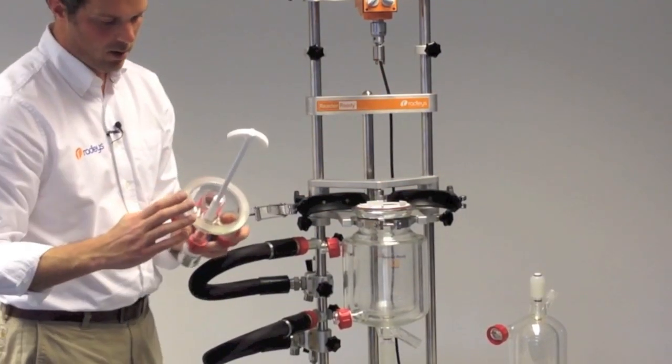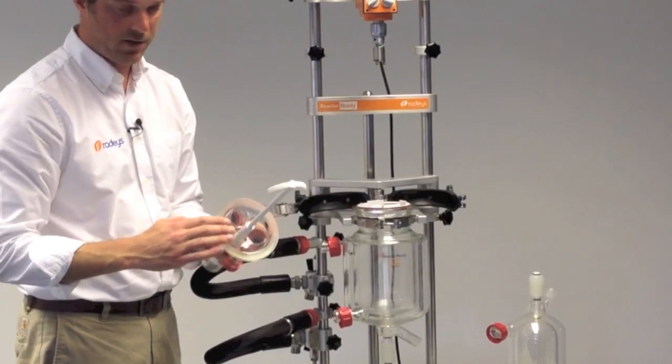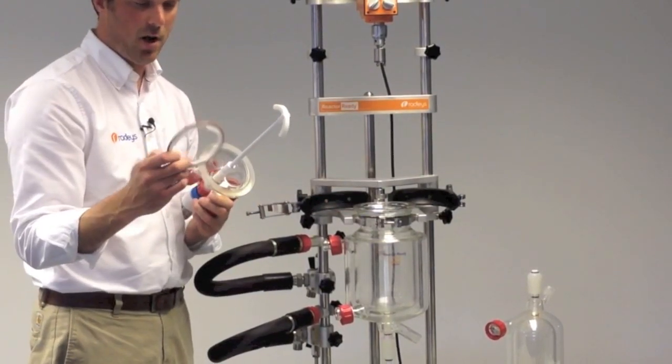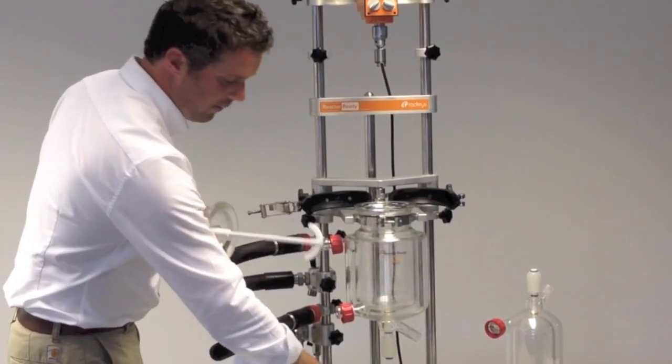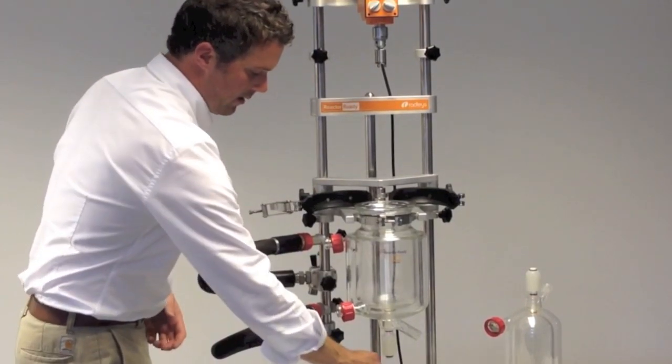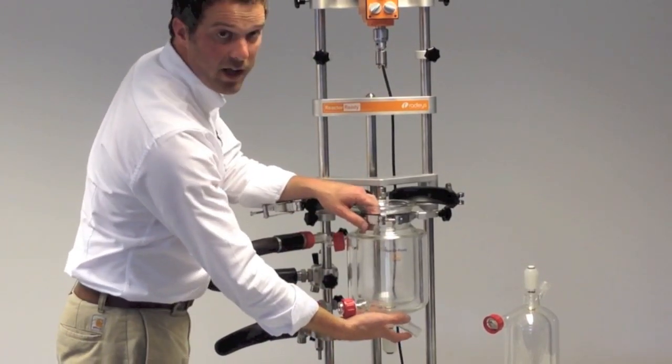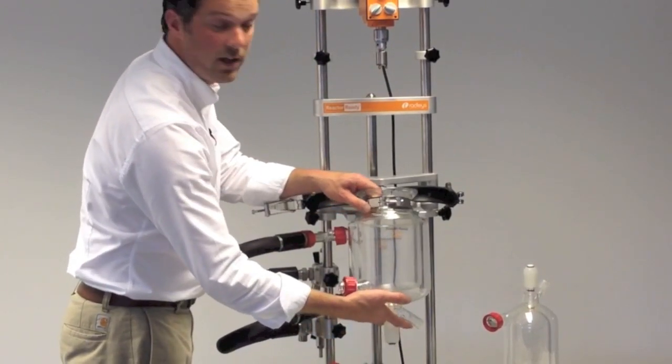You can see on the lid we have a flat flange on the lid, an FEP encapsulated o-ring with a PTFE support collar, and then a flat flange on top of the vessel. The combination of these offers a really good vacuum tight seal.